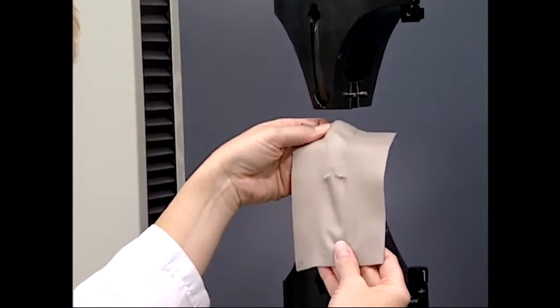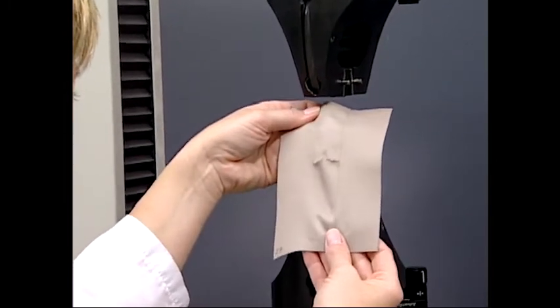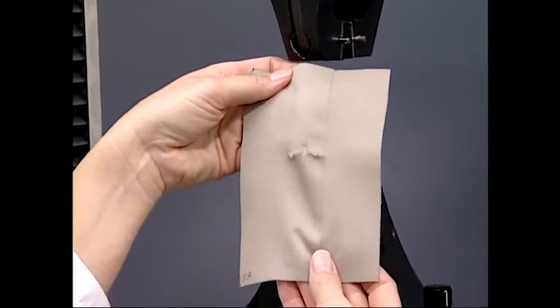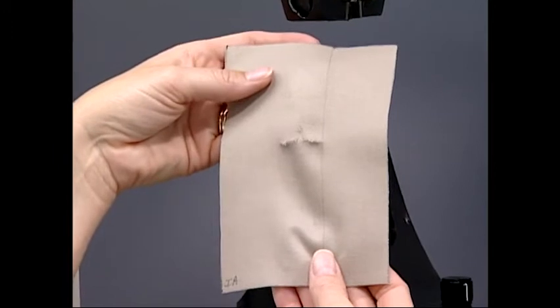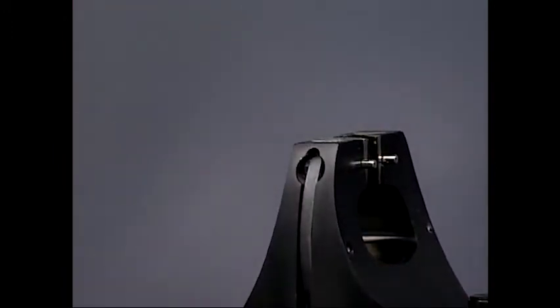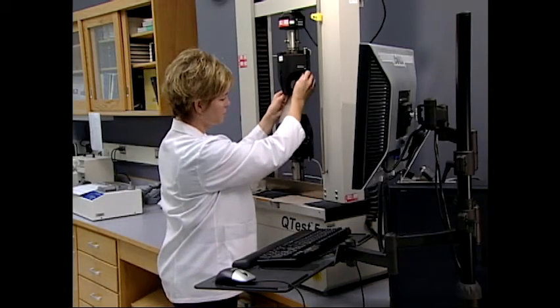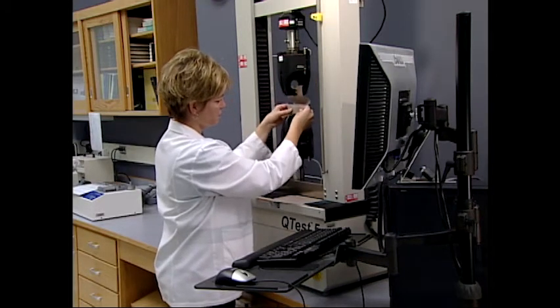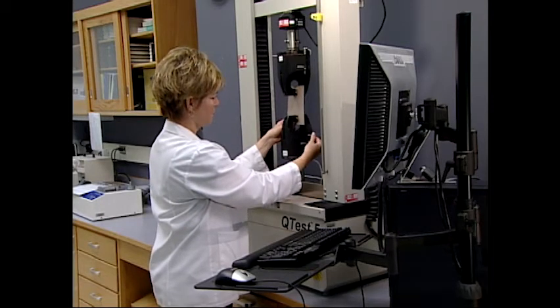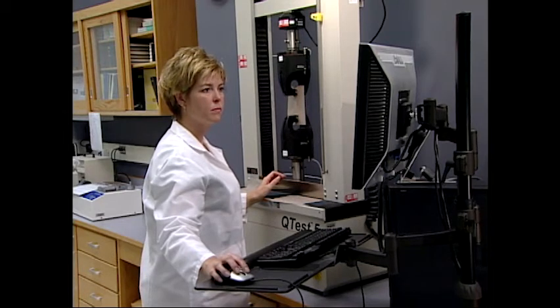This is because the force required to pull a yarn apart is affected by the fiber's strength and the cohesive forces between the fibers as a result of the twist in the yarn. The force necessary to pull a fabric apart is based on yarn strength as well as the weave design. The specimen is mounted in the clamps of the tensile tester and the force is applied until the specimen breaks. Both the breaking force and the percentage elongation of the tested specimen are obtained from the machine scales, charts, dials, or a computer interfaced with the tester.